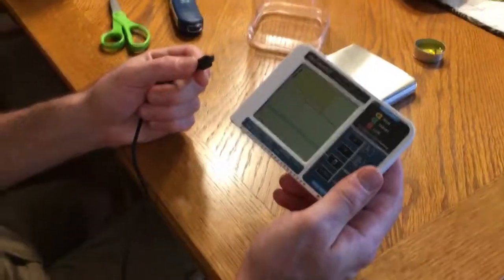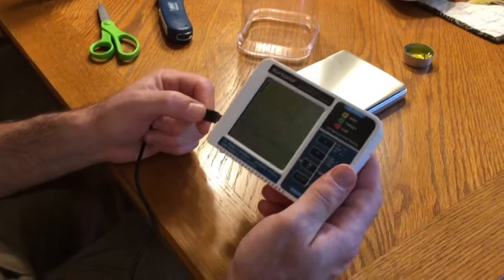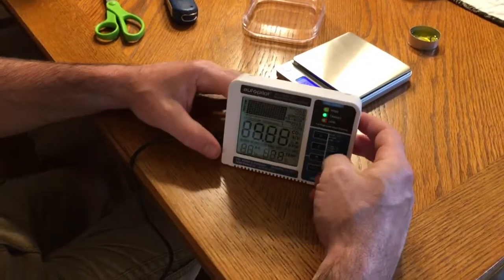This is our CO2 detector and also humidity detector. When you plug it in, it'll take about 10 seconds to calibrate.